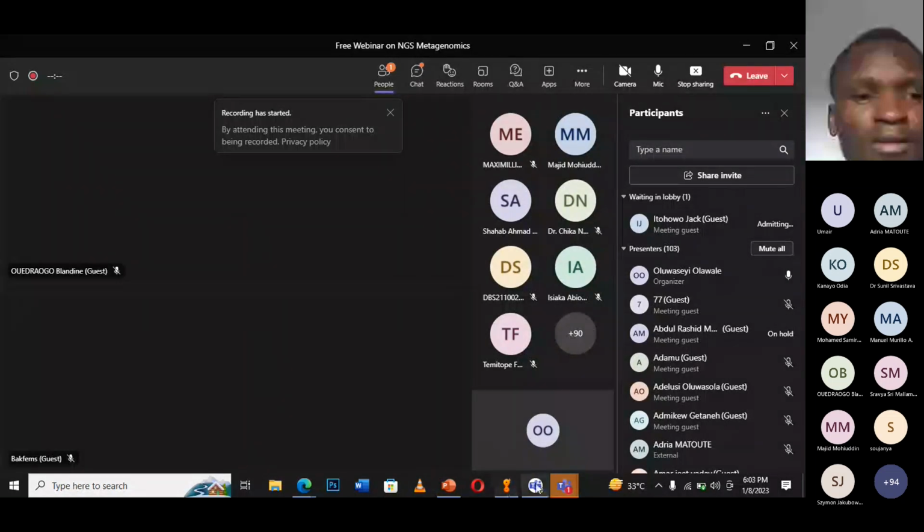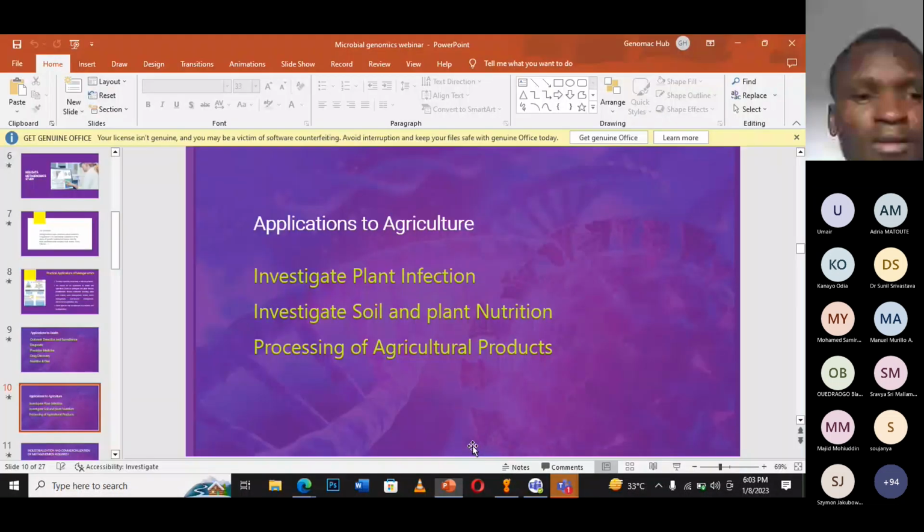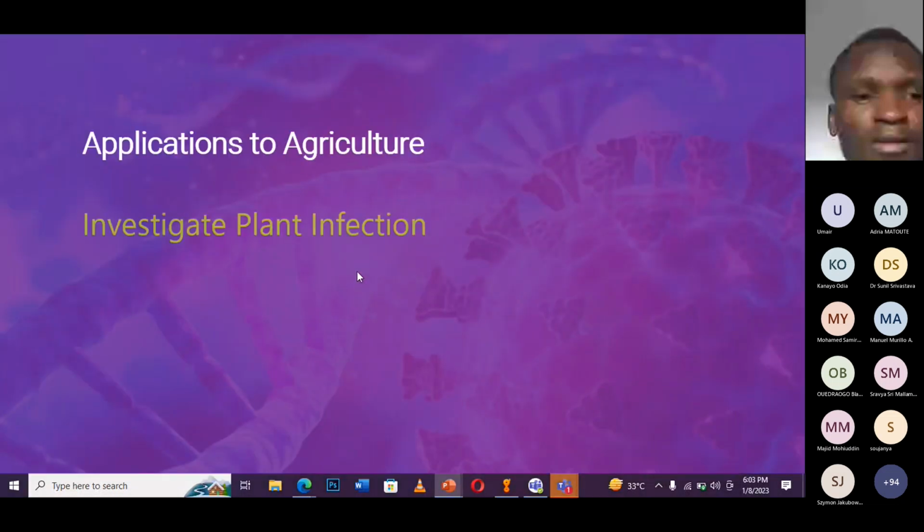Now, there are specific bacteria that are associated with the growth of plants, maybe the yield of particular crops or seeds on the farm. So by doing metagenomics, you will be able to know that it is this particular virus causing this problem, this is its genetic makeup, these are the resistance genes in it, these are the virulence genes in it, and these are the drug targets.